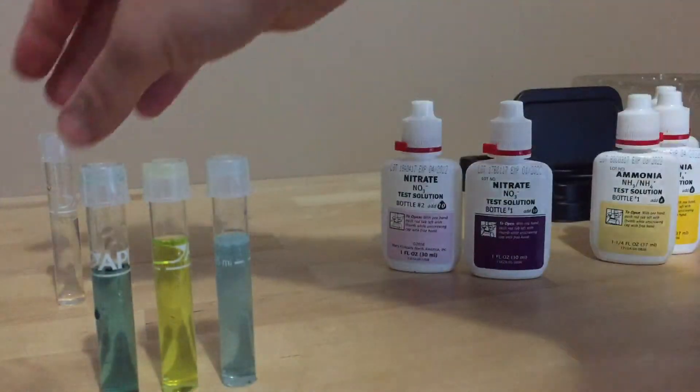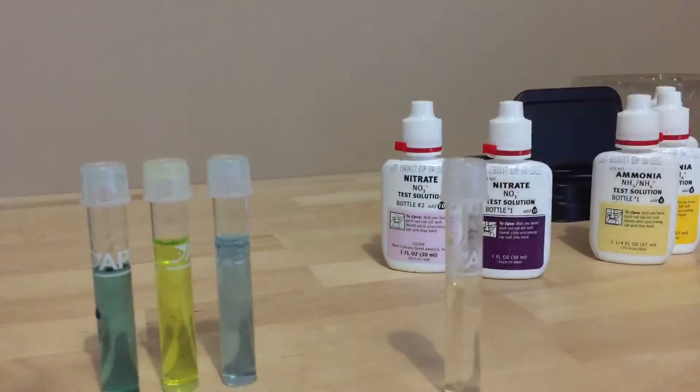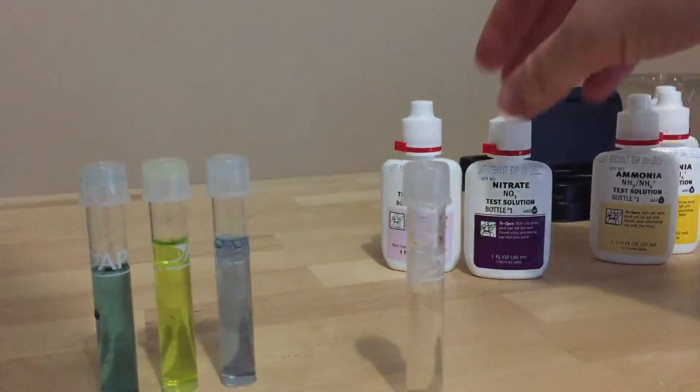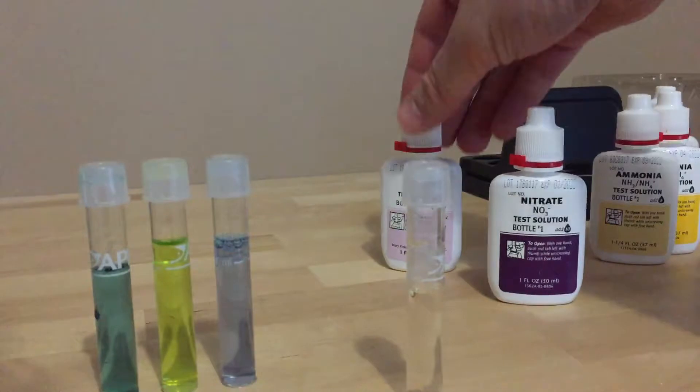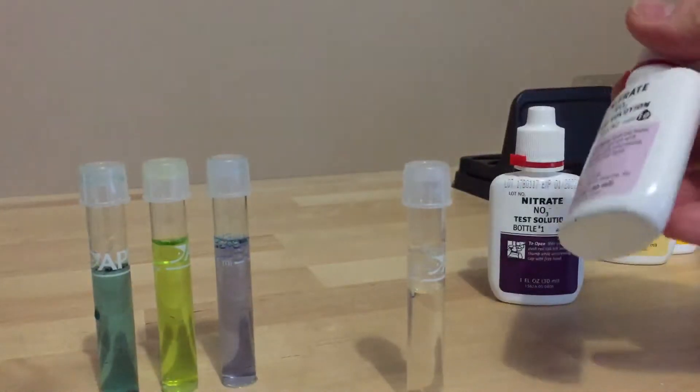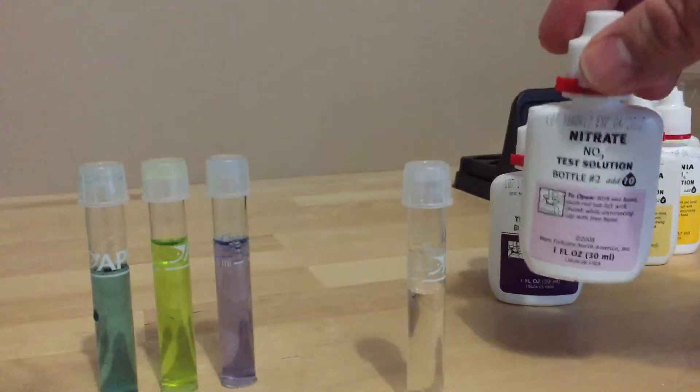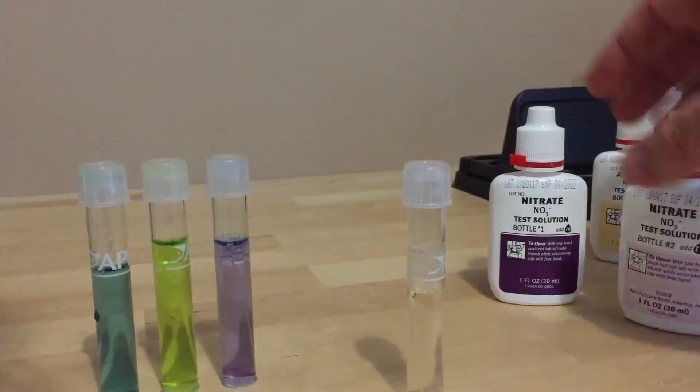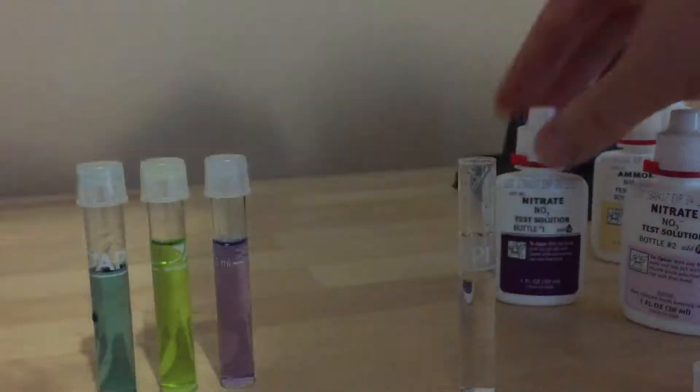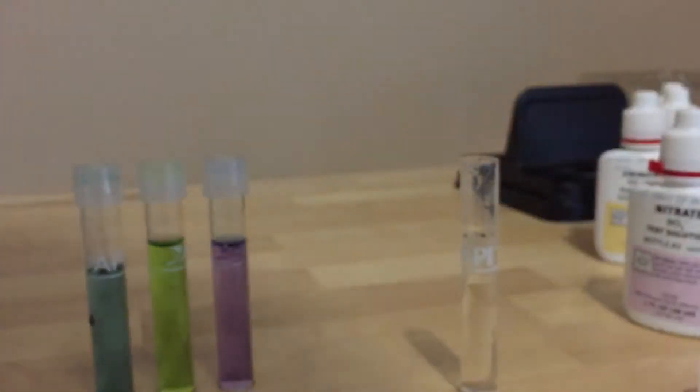And then the final one is nitrate. So this is probably the most complicated of them all. There's two bottles for this one and the second bottle sometimes you need to shake it quite violently just because it can go a bit solid inside. So the first thing to do is, we start with the bottle one and you add ten drops.